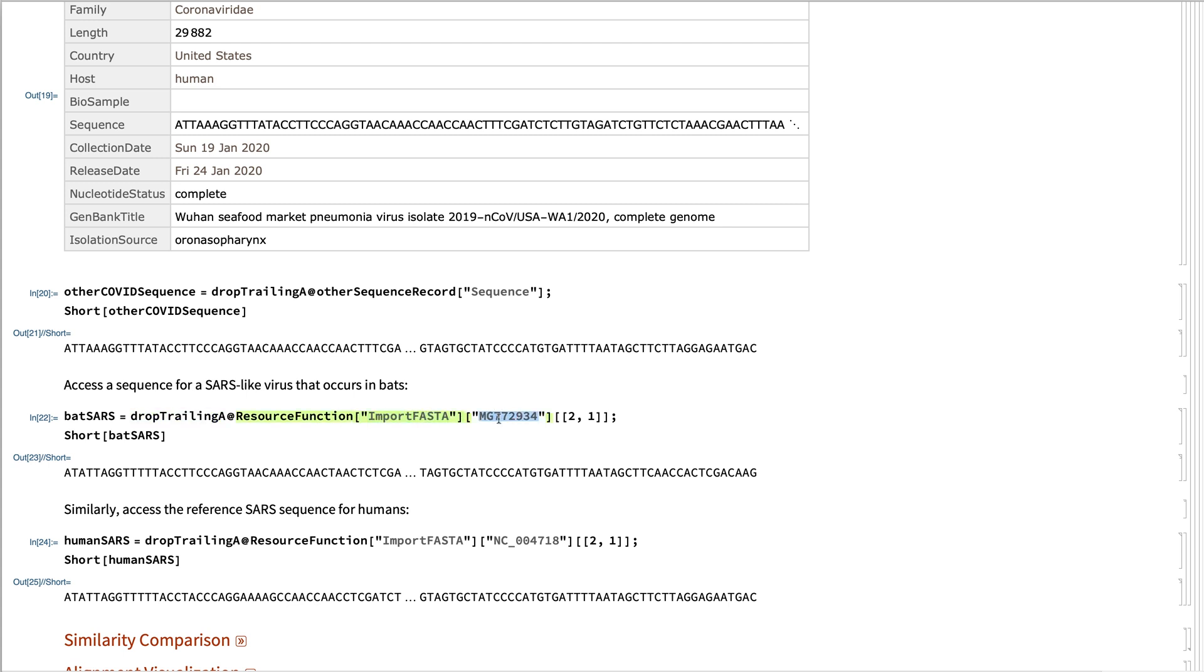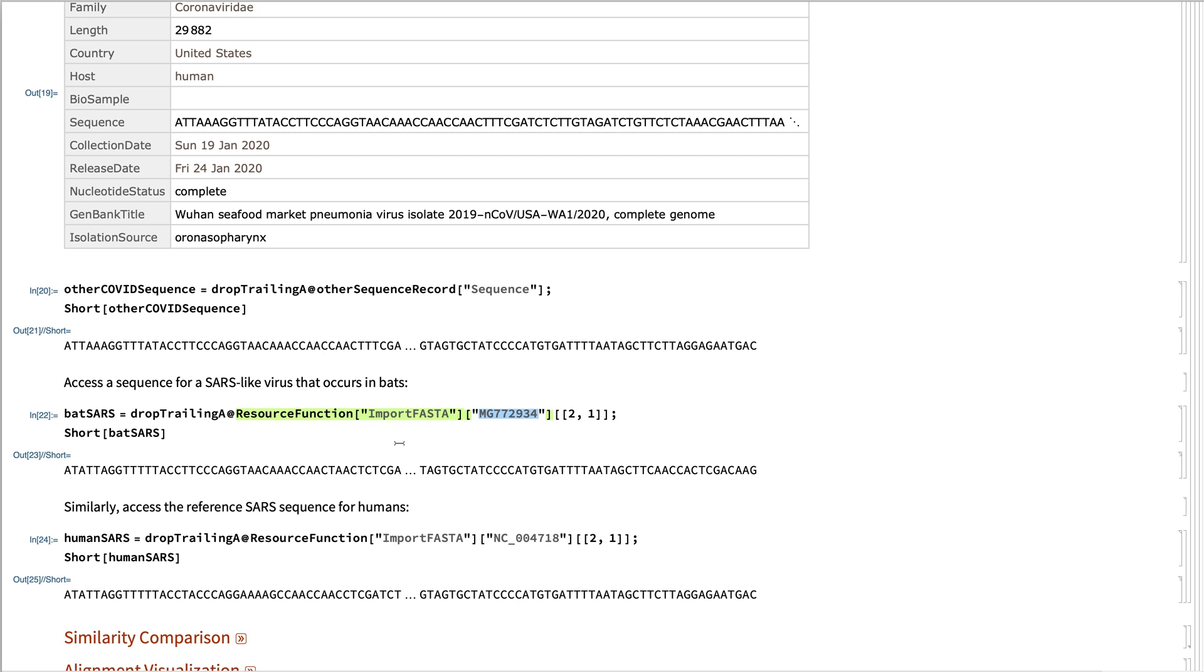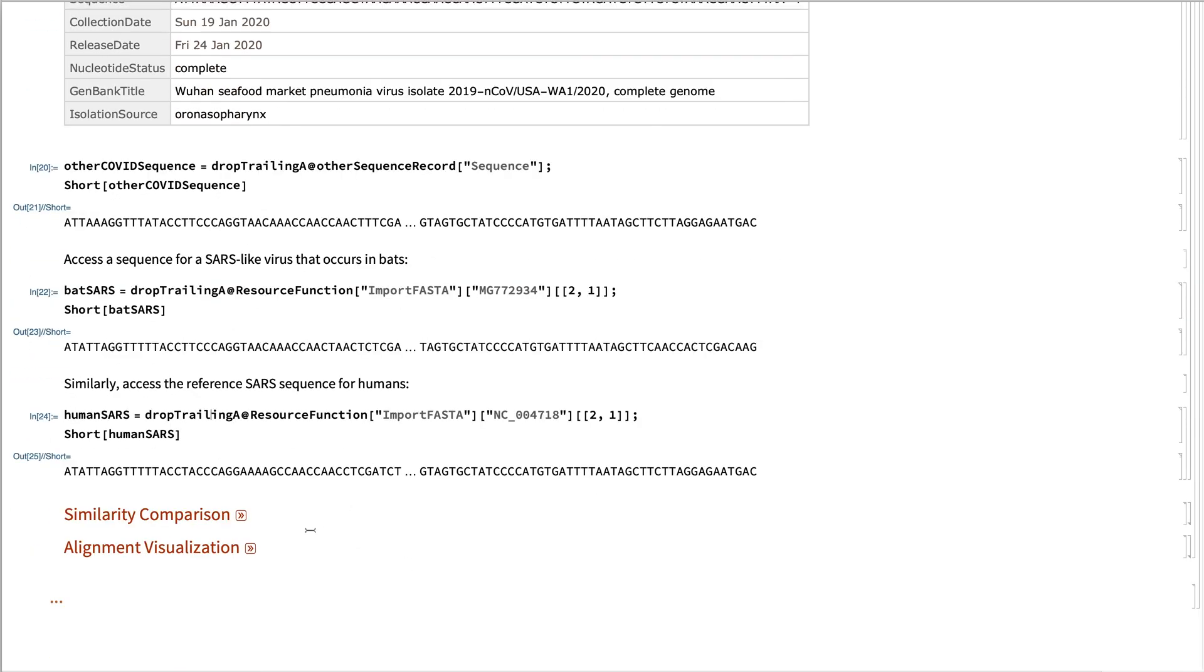And I have its accession ID here. And also I have the reference version of the human SARS virus using this accession together. Here, in all cases, dropping these trailing adenines.